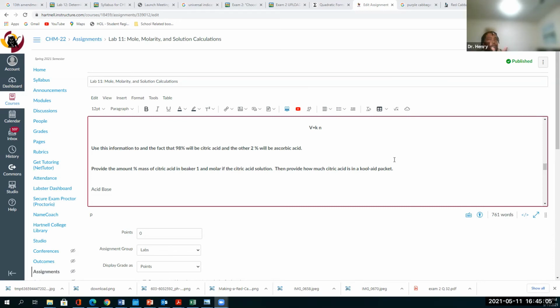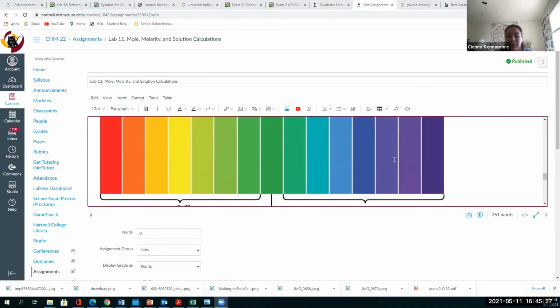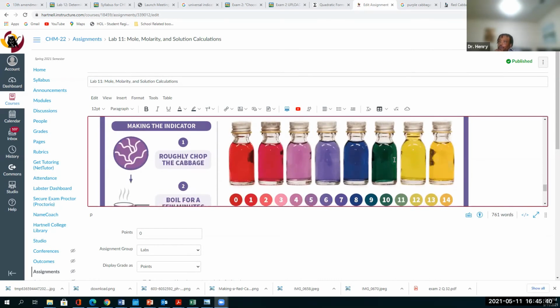Oh, it's also diluted. Remember that, right? So it's like 3% or 5% acidity, right? So that's fine if it's an orange yellow. So that means between 4 and 5 instead of between 3 and 4. Well, no, it's more towards the alkaline side, which is weird. Oh, it's kind of switched. Yeah, because on the indicator for the red, oh shoot, this is for the pH strips. I'm not even on the strip one. And this is for the red cabbage.